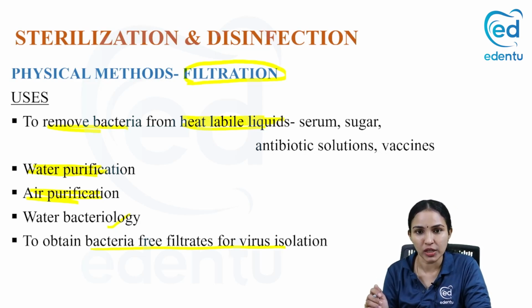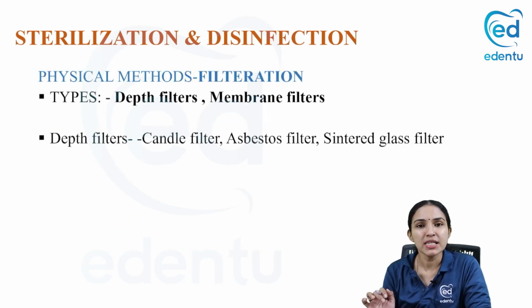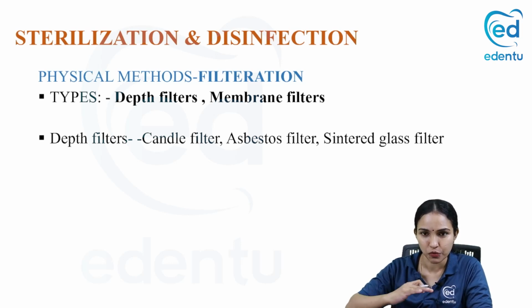For that also you can do the filtration method. The most important application is for removing bacteria from heat labile liquids, water purification, air purification, water bacteriology. You have basically two types of filters, depth filters and membrane filters. Depth filter means the entire thing will be used as a filter. It's not just a single surface filtration.